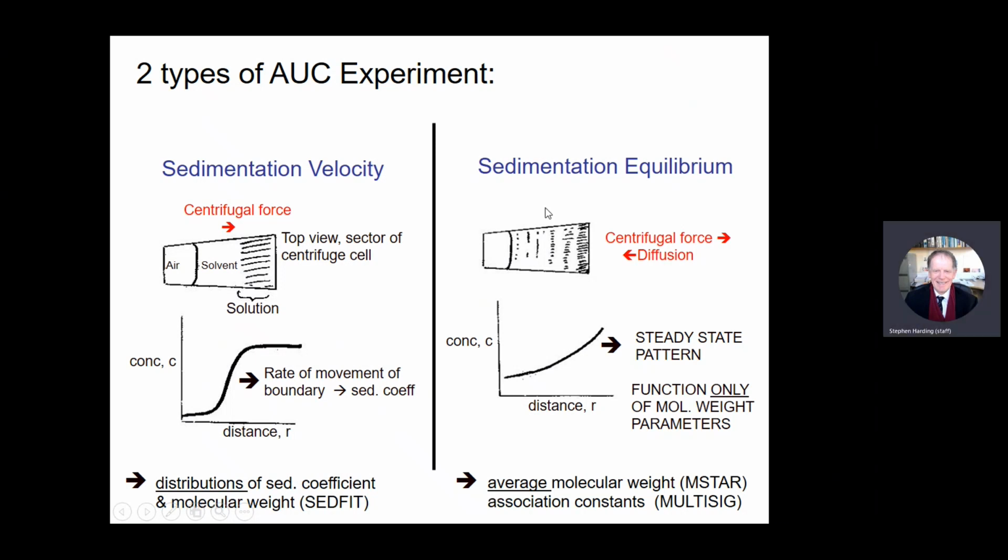But using sedimentation equilibrium, you can get the average molecular weight using M star, or now SEDFIT MSTAR, because the MSTAR algorithm has been built into the SEDFIT program. So there's a SEDFIT MSTAR program now, which gets the molecular weights for you. And another one called MultiSig as well, which is useful. So we can get molecular weight.